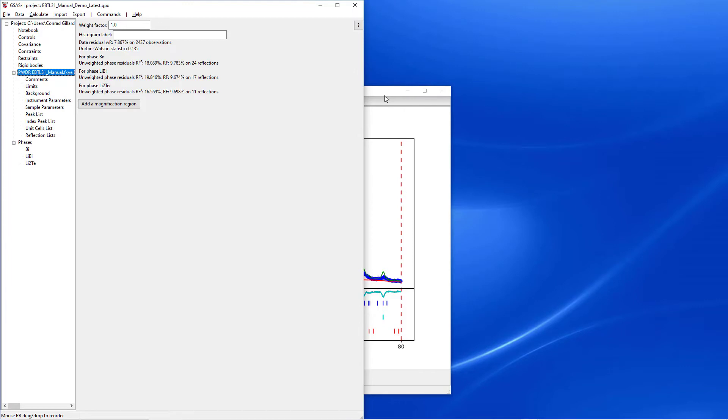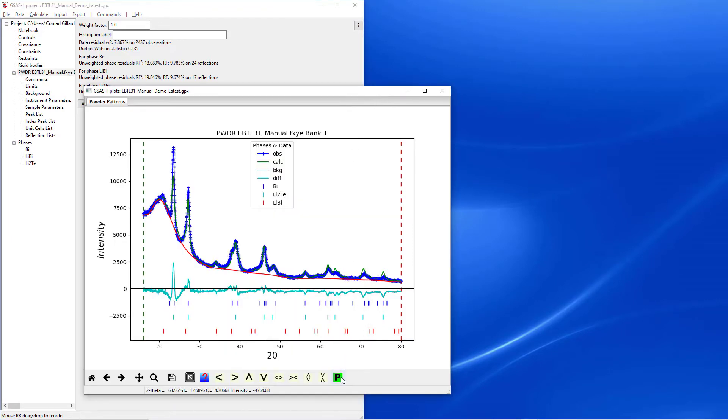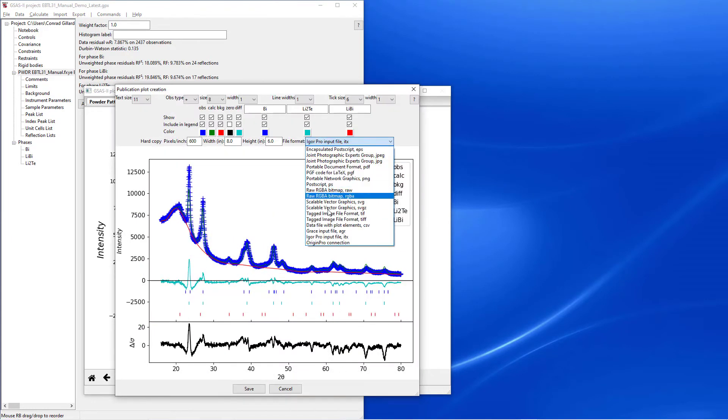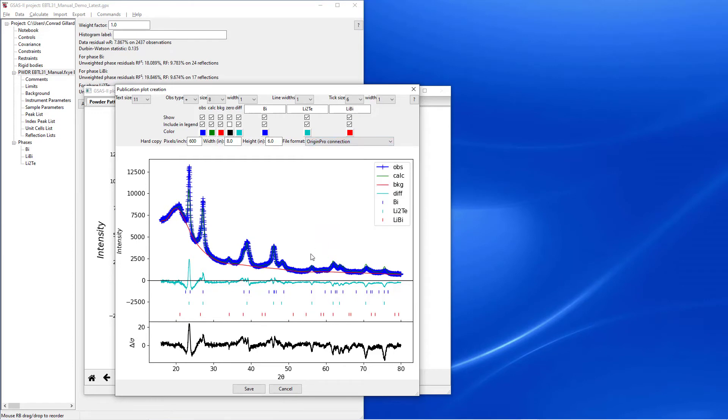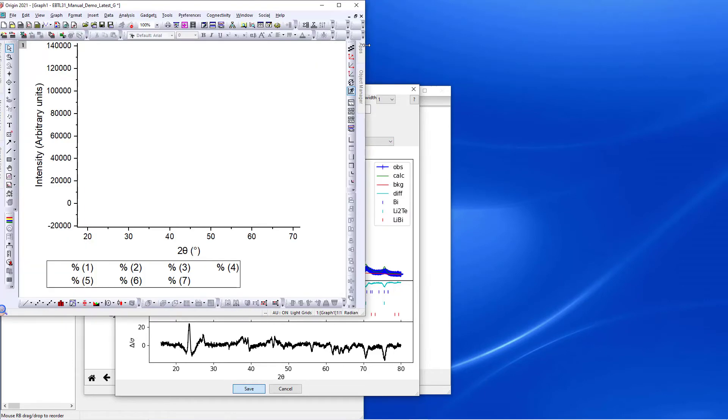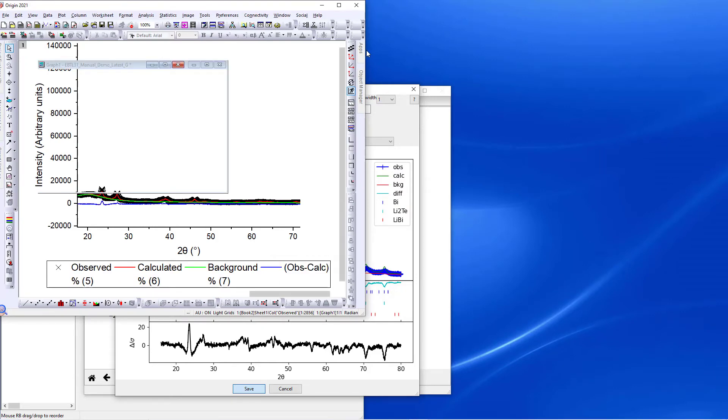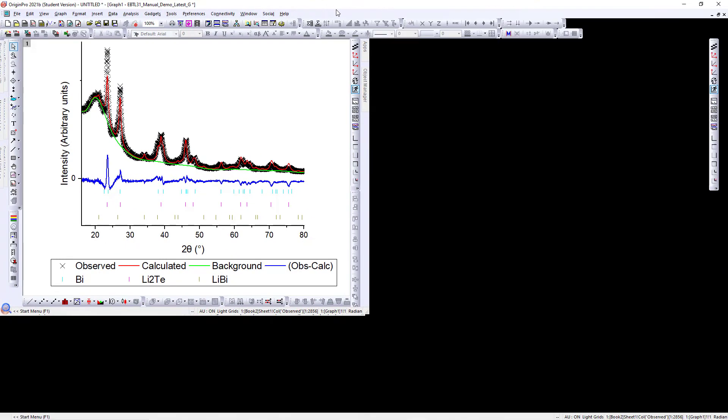Next, users click P on the plot window and select Origin Pro Connection from the drop-down and click Save. GSAS2 then automates Origin to produce a figure of the plot.